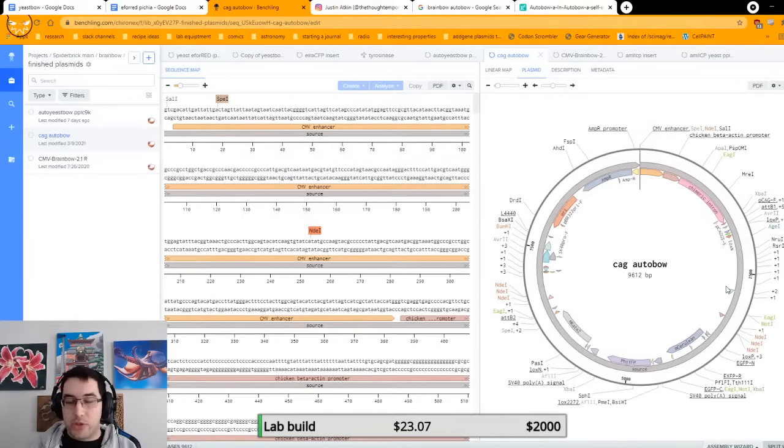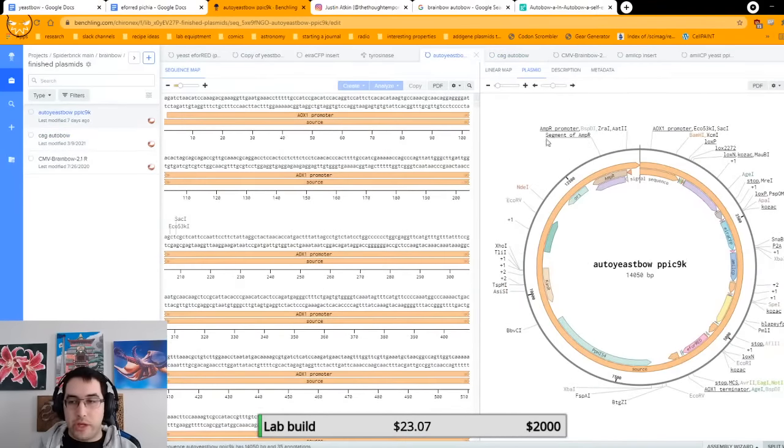But basically I took this same structure where you have a general promoter, right? This turns the gene on. Then you've got the three lox sites here, then Cre, and then three colors, right? The colors don't match what they actually are, but that's fine. So what I did was I took that same basic structure and redesigned it to work in yeast. Everything has been redesigned to work in yeast.